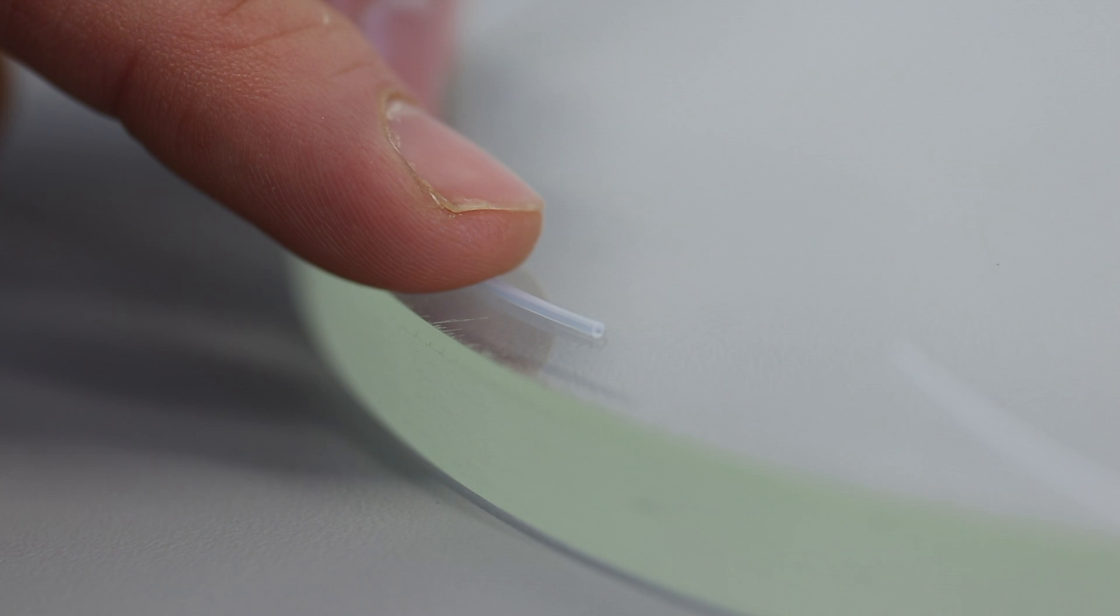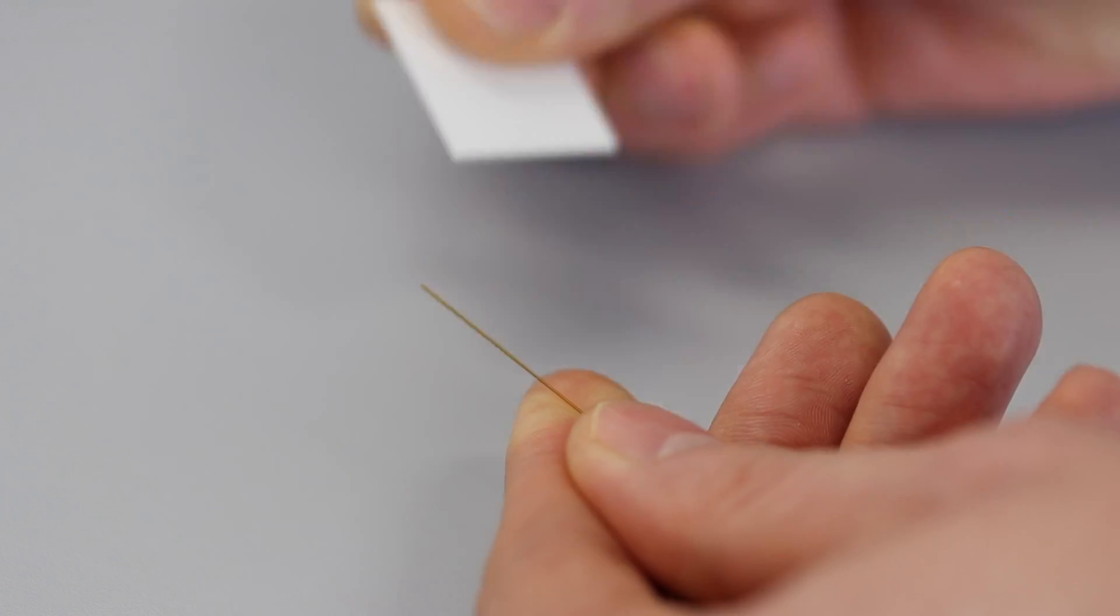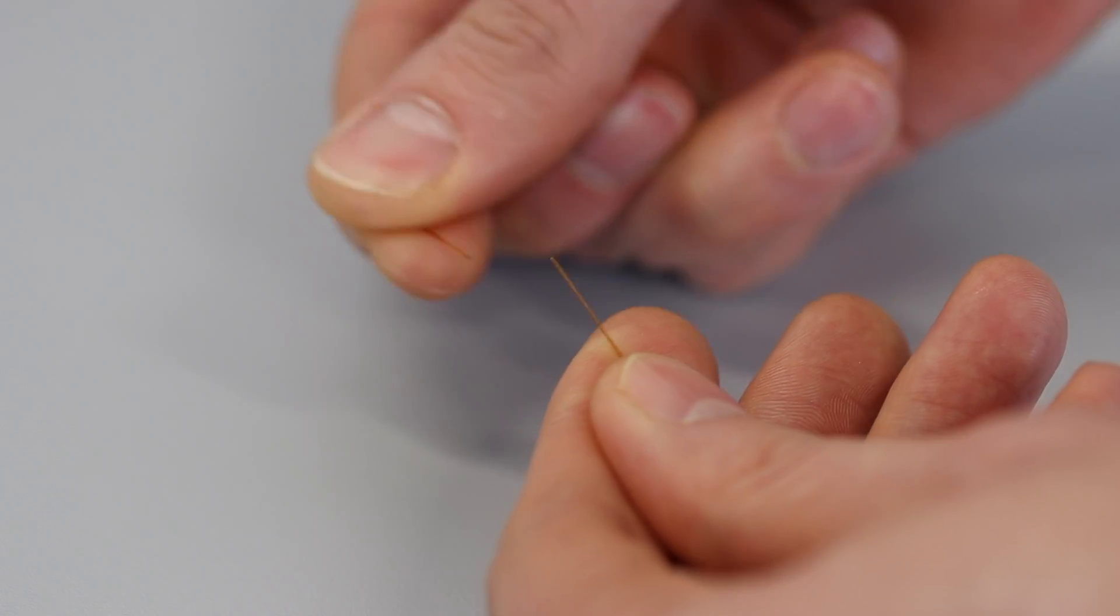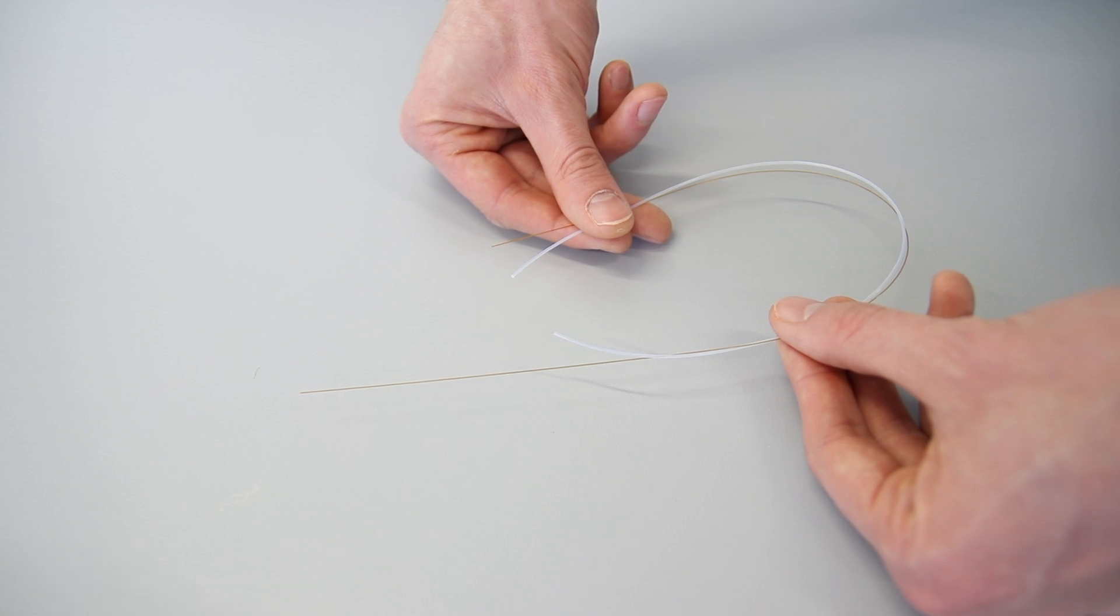Prepare the PTFE protective tubing and the fused silica capillary. To cut the capillary, use the fused silica tubing cutter. It should be approximately 5 cm longer than the PTFE tubing.